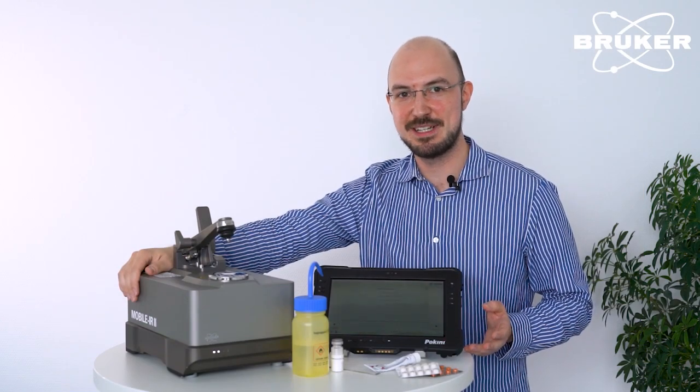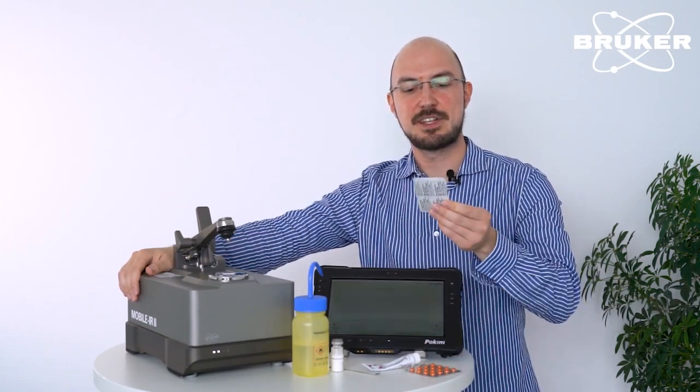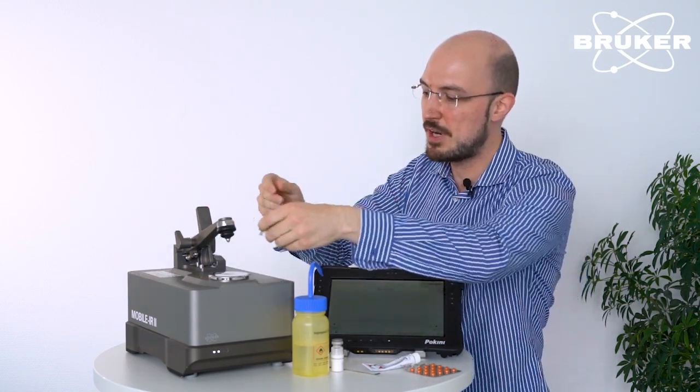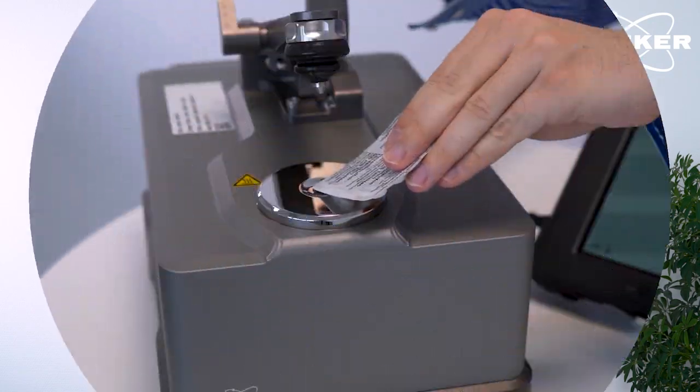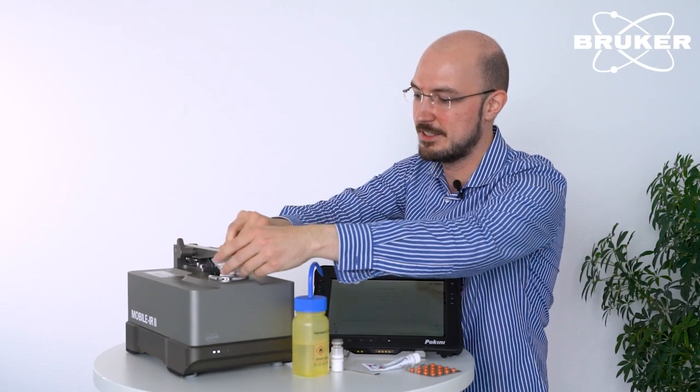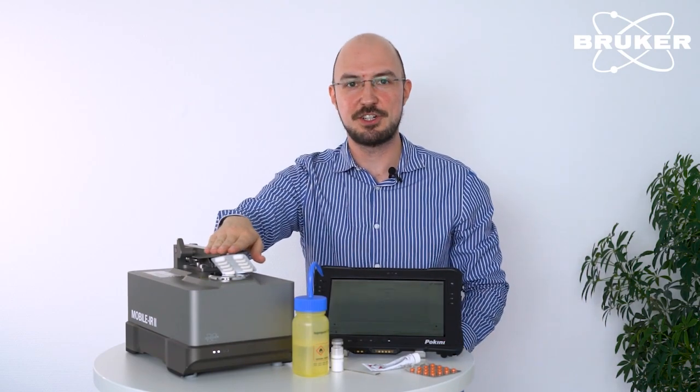After the background measurement is done, we start with some tablet packaging. We press our packaging on the ATR crystal and fixate it, so that we have good pressure on the crystal.